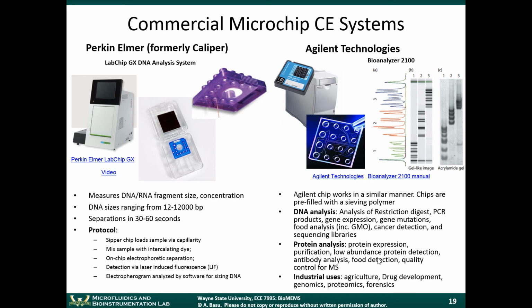And then there's other industrial uses as well in agriculture, drug development, genomics, proteomics. So this is a very workhorse type technology. Any type of life sciences lab will have some type of capillary electrophoresis system in there. And thanks to miniaturization and BioMEMS technologies, these systems are much faster now than they used to be.